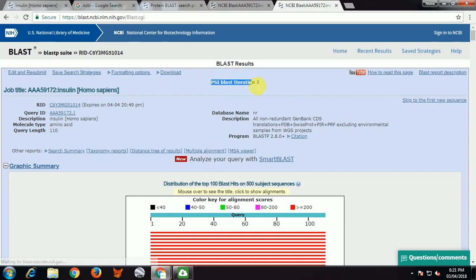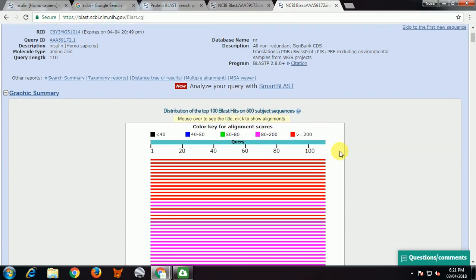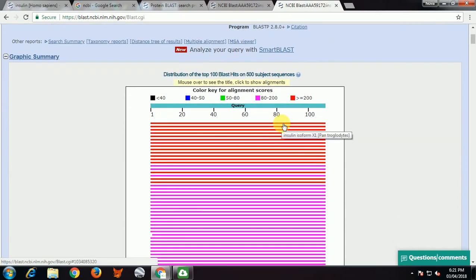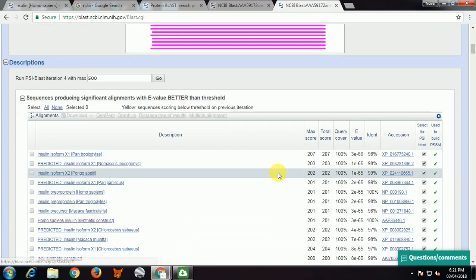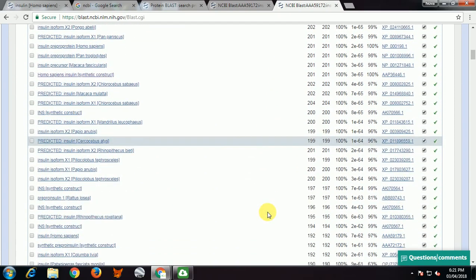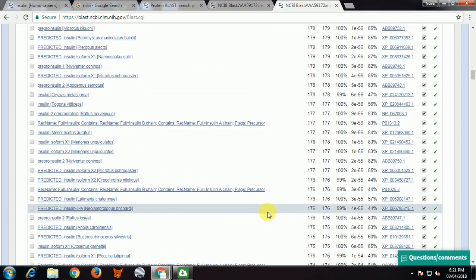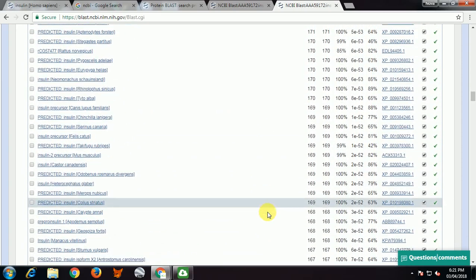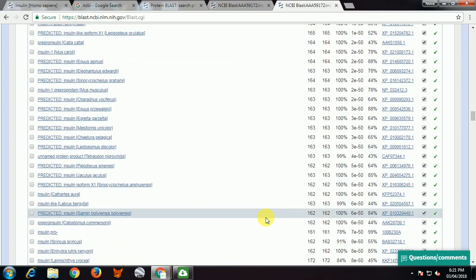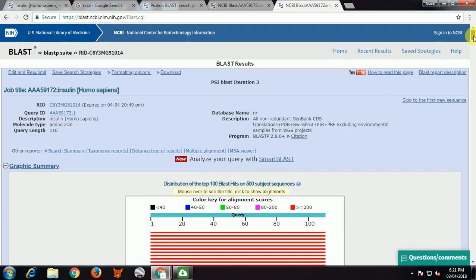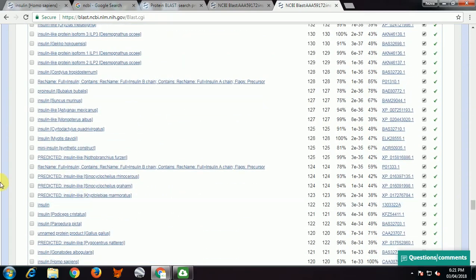We will see the result of the third iteration. This is PSI-BLAST third iteration — request ID, query ID, description, database, program used. You can see the alignment. Just explore the result: see how much identity there is, what the positives are, and how many gaps have been put when alignment has occurred. The sequences highlighted in yellow are divergent sequences from the third iteration.